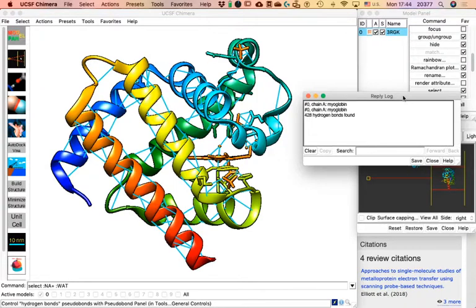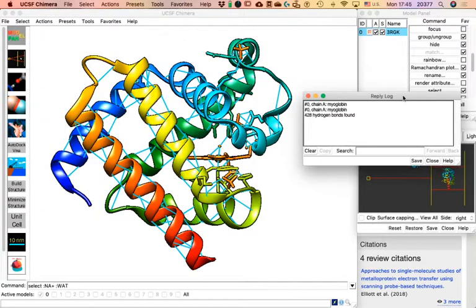I got 422. I don't know why my computer gives different results. Whatever number you got — 422 or similar — if you didn't get zero you're fine. It may be a difference related to the Chimera version: I have 1.13.1; some of you may have 1.14. Bring out your results and go to Tools > Structure Analysis > Find Hydrogen Bonds.